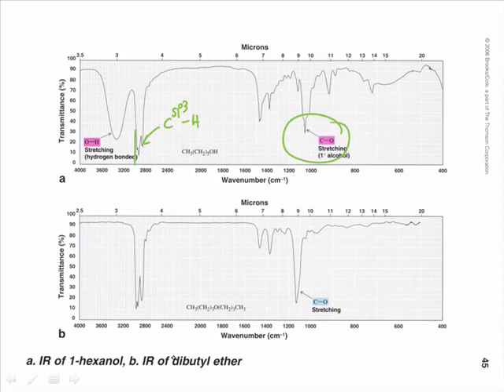The next example highlights that quite well. Again, we have now almost exactly the same spectrum. If you think about this, this part is the same, this part is relatively similar, this part is the same, but there is no OH vibration. And so since there is no OH group, this is probably an ether, and indeed it is.